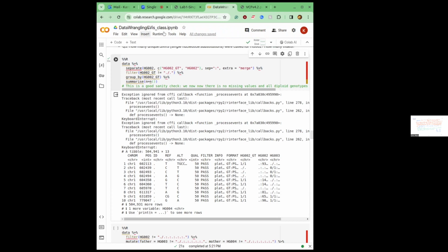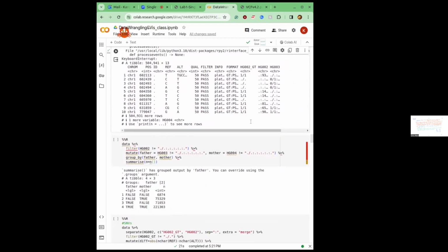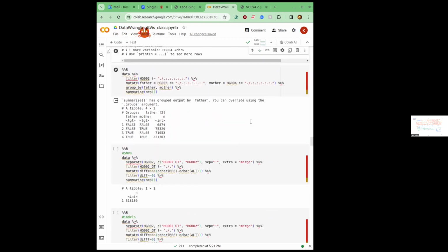Okay, not enough time to go through everything, so let's just go overview wide at the beginning of this file, and then you can go through this file at your own pace. I will post the solutions.